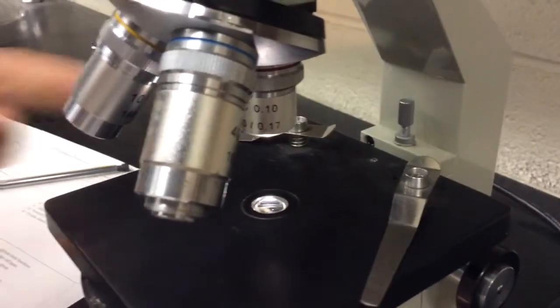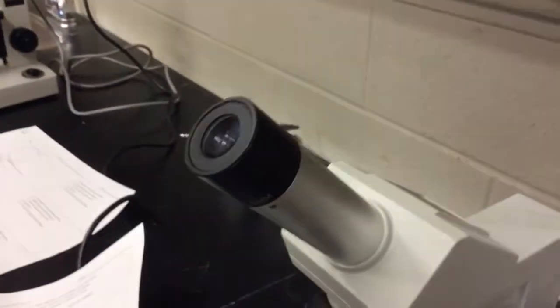And then what lens do you need to have in place to focus it? The small one. Alright. Okay, so if this guy here is 10, and this guy down here is 4, what's your total magnification?